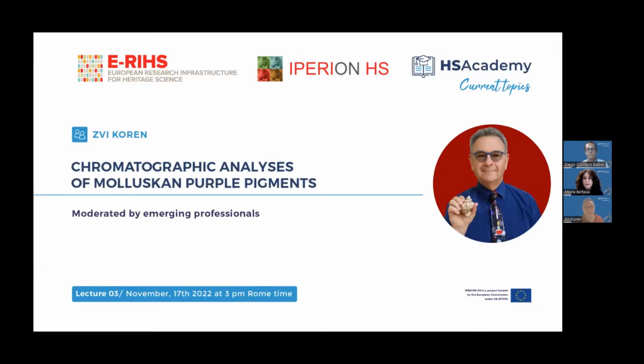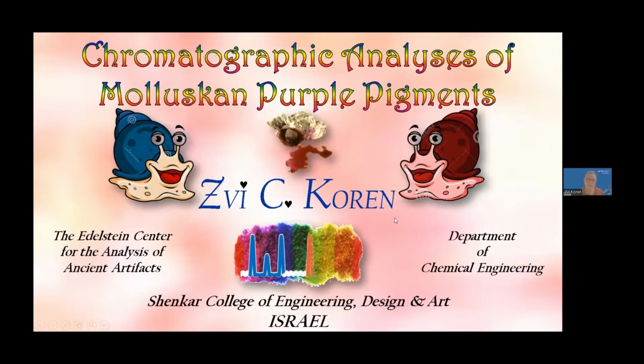Actually, the topic today is a twofold topic. It will deal with a bit of chromatography and a lot of purple pigments, a two-pronged approach into the problem. So here's my design of the slides: chromatographic analyses of molluskan purple pigments.